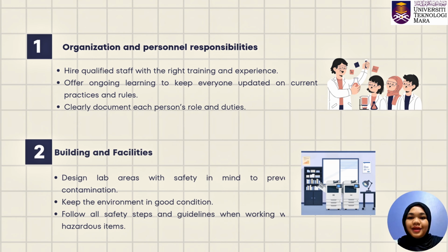Number 2. Building and facility. Design lab areas with safety in mind to prevent contamination. Keep the environment in a good condition. Follow all safety steps and guidelines when working with hazardous items.